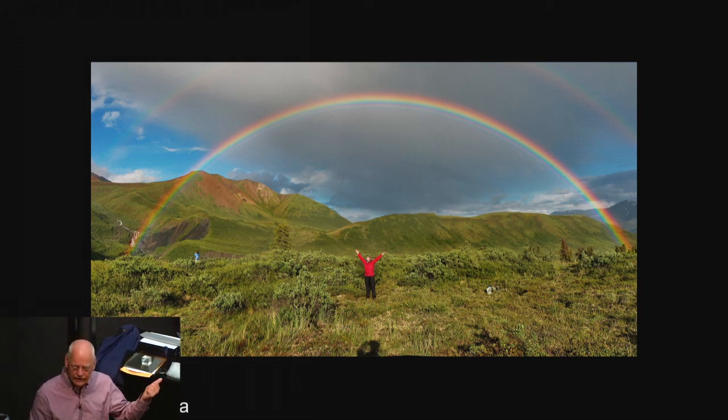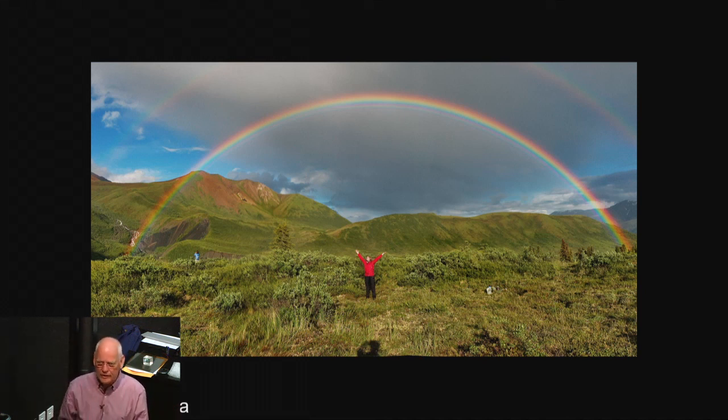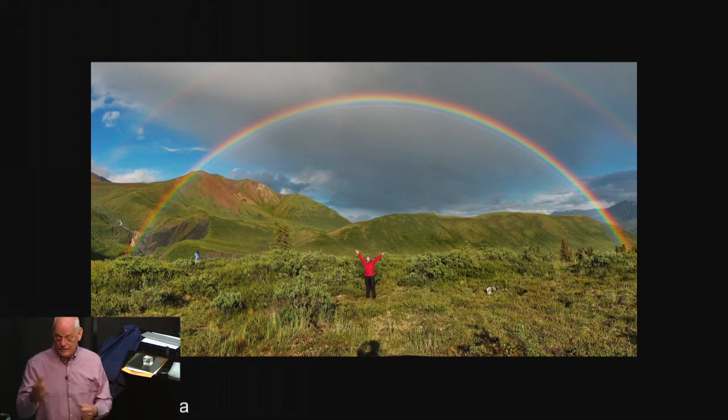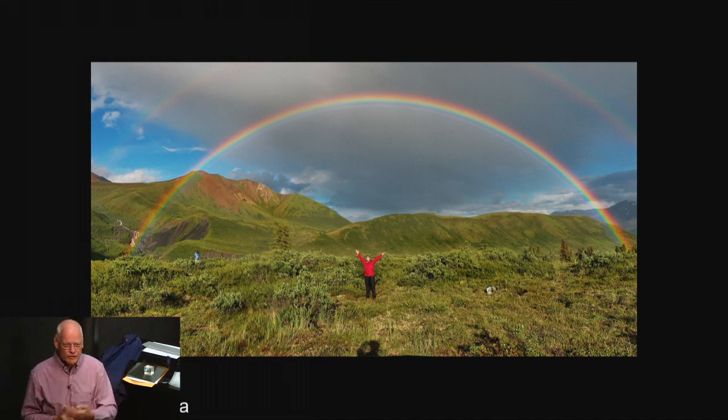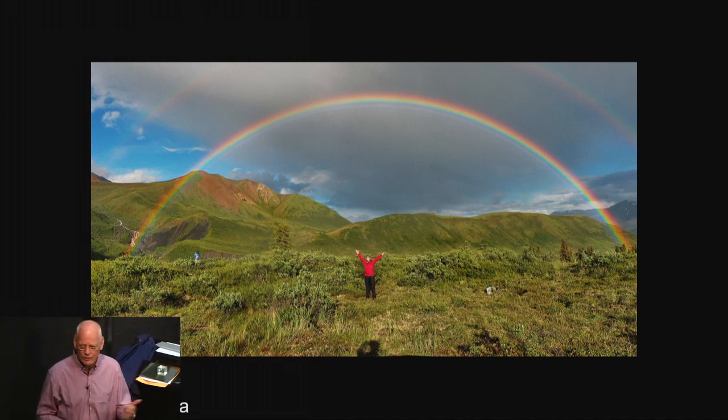We can't tell that it is microtubules, the chemical nature of these biofilaments that form the spindle and make the birefringence, that this is actually tubulin. Polarized light can't give you that.